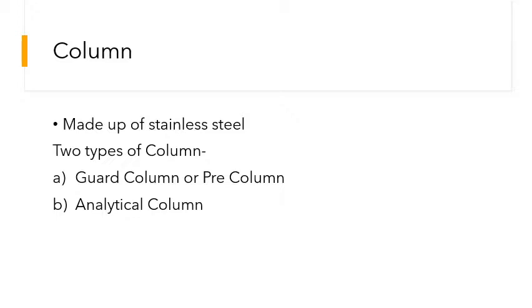So its cost is low. We do not have the problem of destroying the column, because the analytical column, which is the main column, should not be destroyed. To protect the main column, the analytical column, this guard column is used. So it plays a very important role.